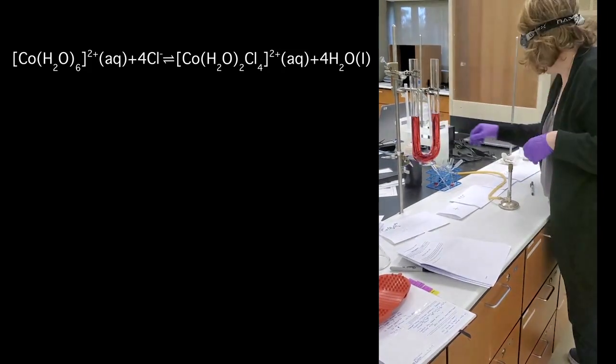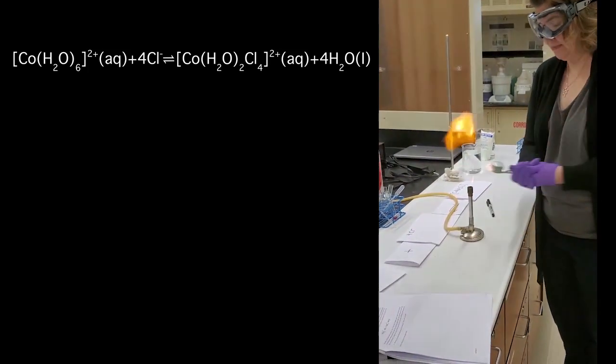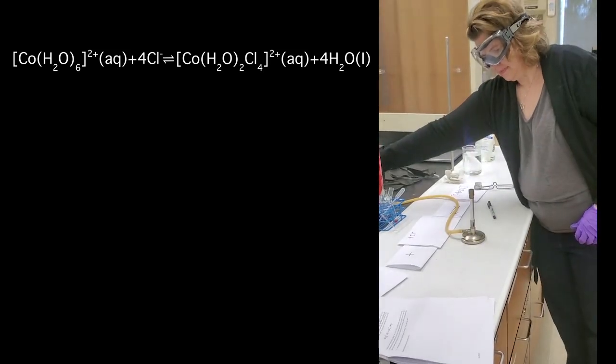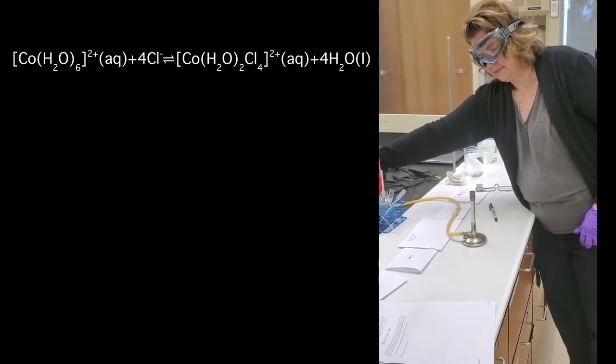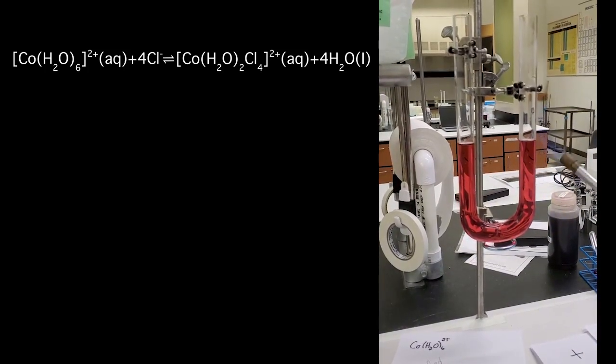Did you remember to get a striker? I put it together to light a Bunsen burner on camera without messing up. So here with the YouTube tube, this is kind of nice — I can heat one side and leave the other side as it is. We can compare the temperature. I'm going to heat this side right here.